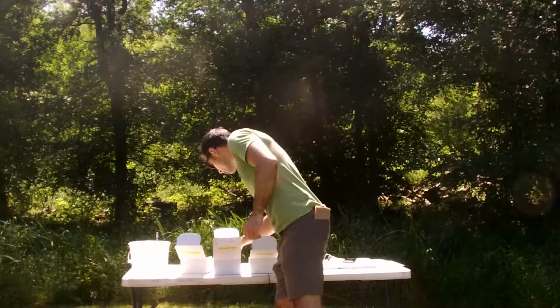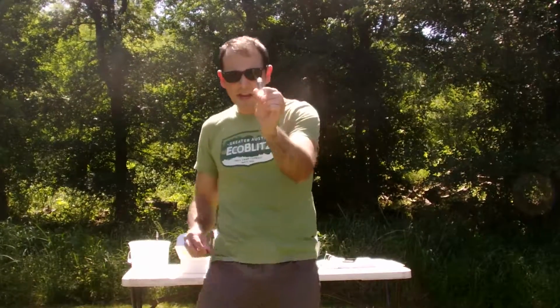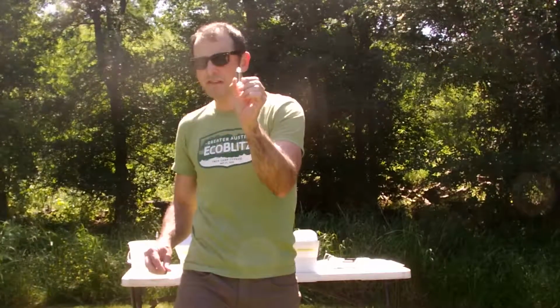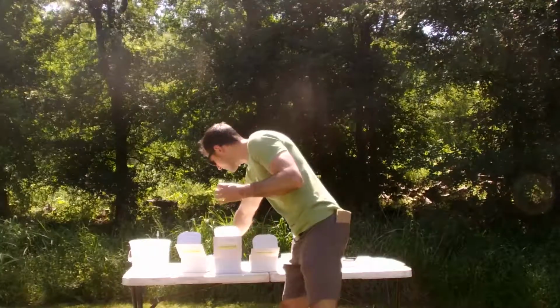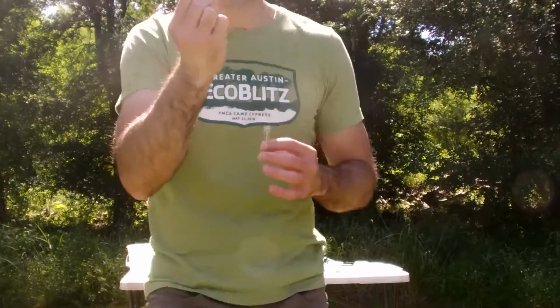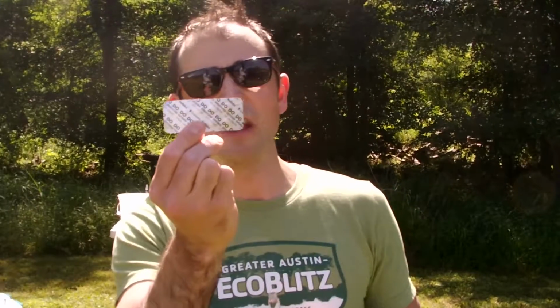So what you'll do is you'll take these about 125 right here, which is all the way to the top. And this is glass. Everything else is plastic, so you'll be very careful with your kids in this one, okay? Because it is glass. If we were in a classroom, they'd probably say plastic only. You're going to take your dissolved oxygen tablets, which are these guys right here, okay? Now, they do say DO on them, all right? So when you're talking to your students, say, hey, make sure you grab the silver package, because they're all silver packages, that say DO, all right? Dissolved oxygen. They're going to pop 2 of them in there.